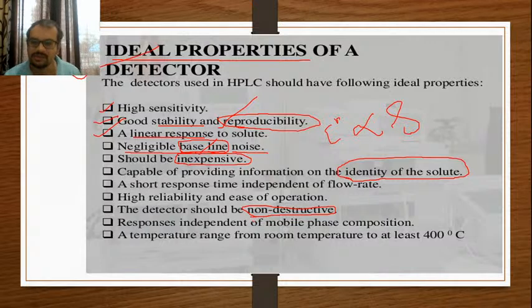I'm going ahead. The response is independent of the mobile phase composition. No need to explain, as I already dealt with it. Whether we are dealing with the flow rate or the composition of the mobile phase, the response should be independent of both, that is mobile phase flow rate and mobile phase composition.